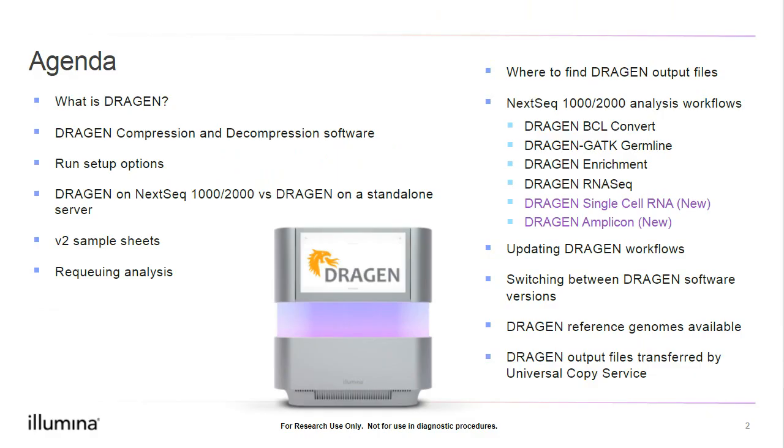First, I would like to preface that this is a repeat of the previous NextSeq 1000 and 2000 Introduction to DRAGEN webinar, given in October of last year. However, this webinar has been updated to include many of the new features that have been introduced to the NextSeq 2000 DRAGEN analysis since then.